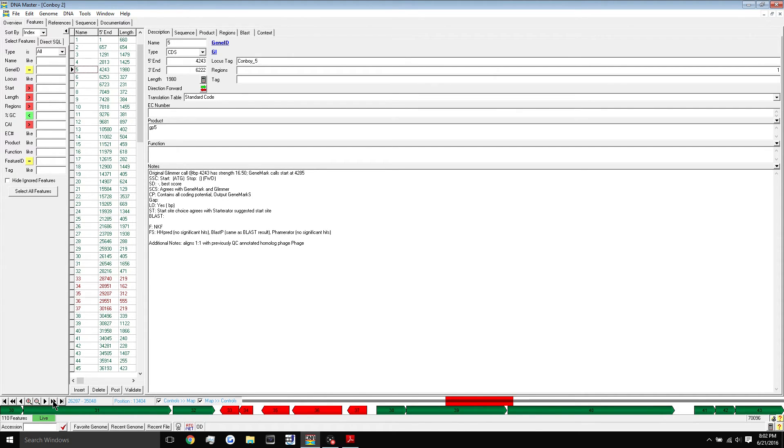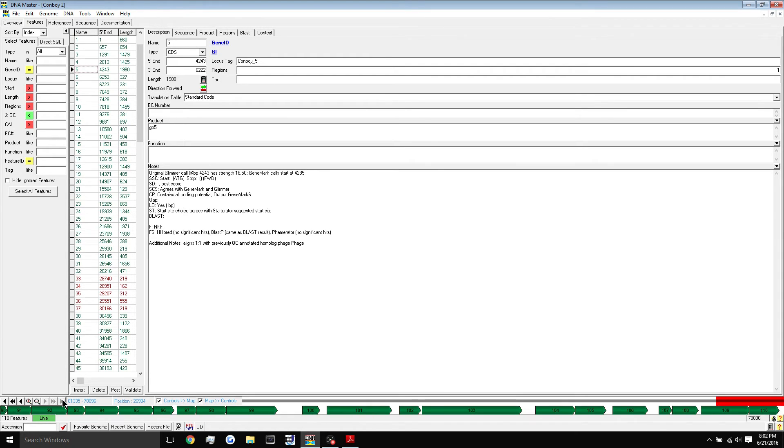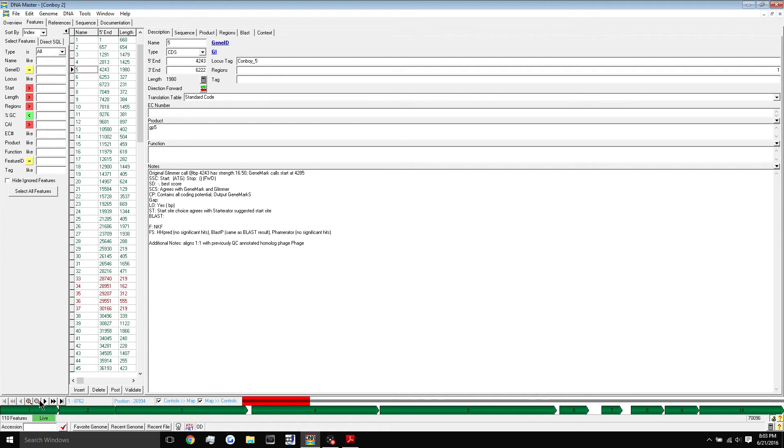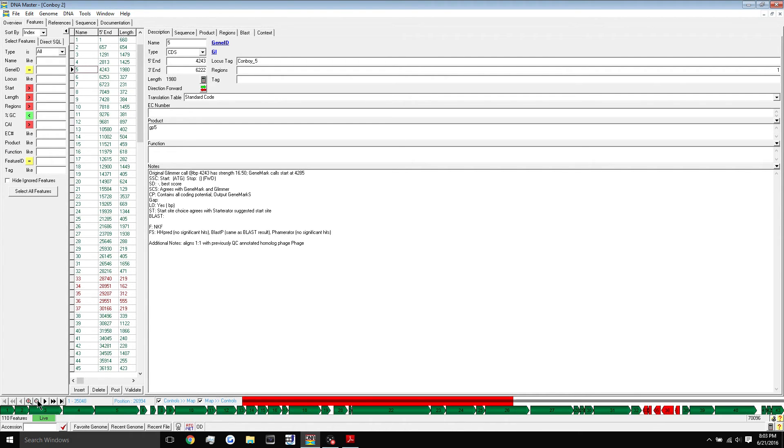If you want to move all the way to the end of the genome, hit this arrow with the line next to it and that will bring you all the way to the end. Likewise for the left, this will bring you all the way back to the beginning. So that's how you move around your map at the bottom of the screen.